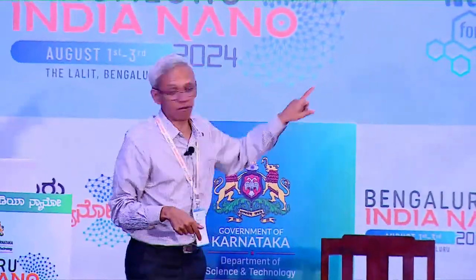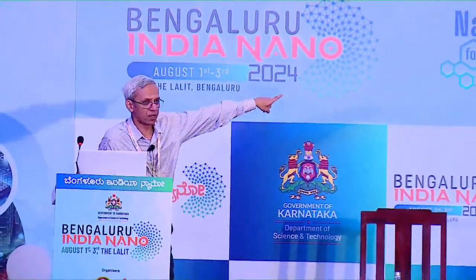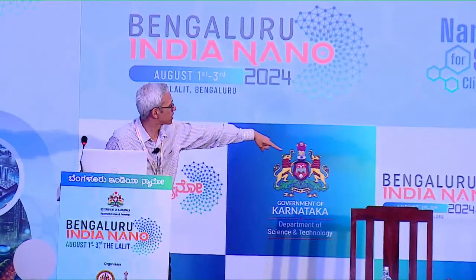And suppose I have a very, very fine probe that I can locate on individual atomic columns. I can tell you which atomic column has higher average atomic number and which column has lower average atomic number. Okay, I'll show you this example. We have a fine probe here. I will run this animation. We have a fine probe that's falling on the specimen, and it's passing through the specimen.